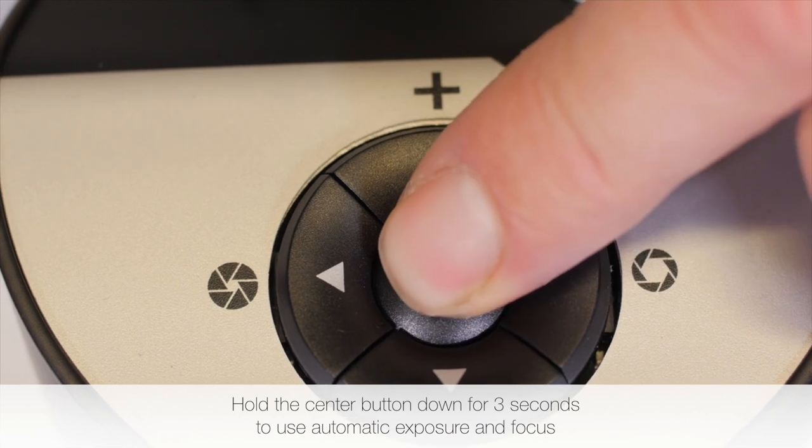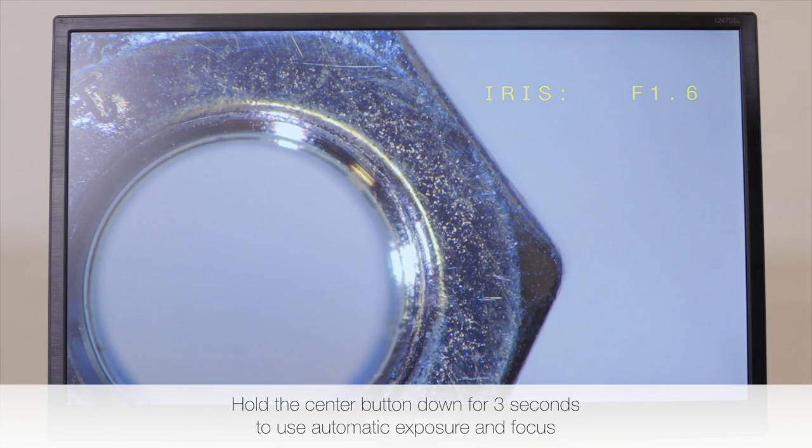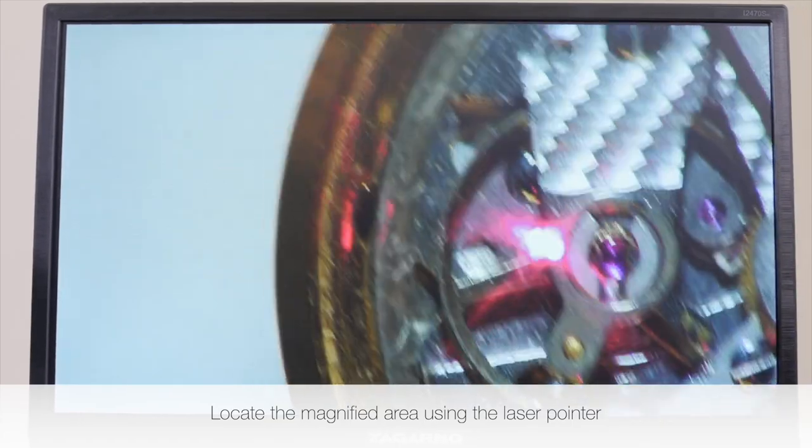Hold the center button down for 3 seconds to use automatic exposure and focus. Locate the magnified area using the laser pointer.